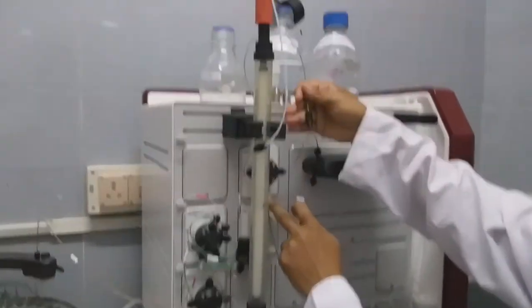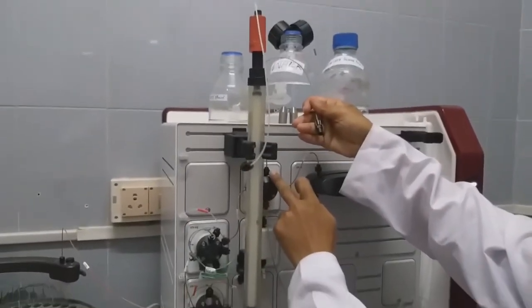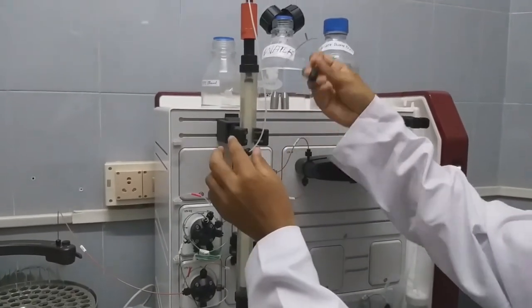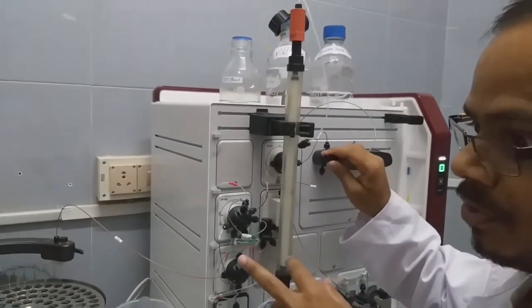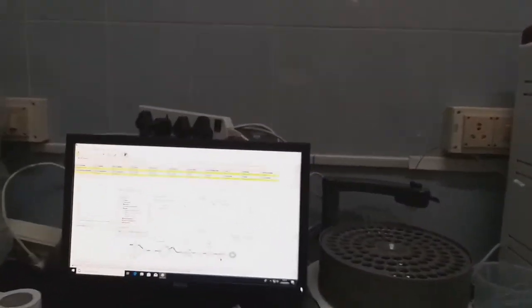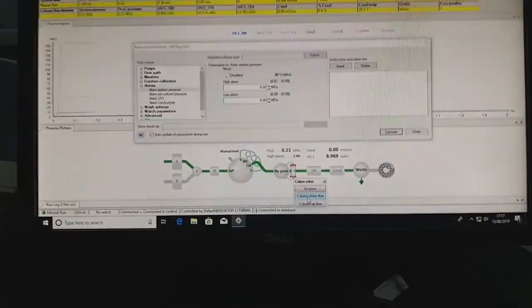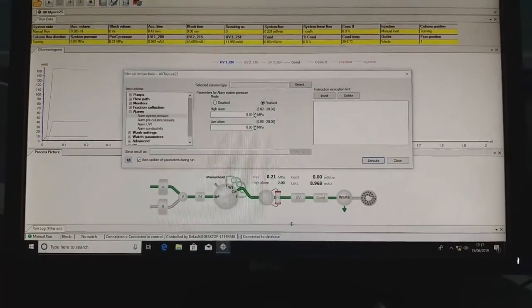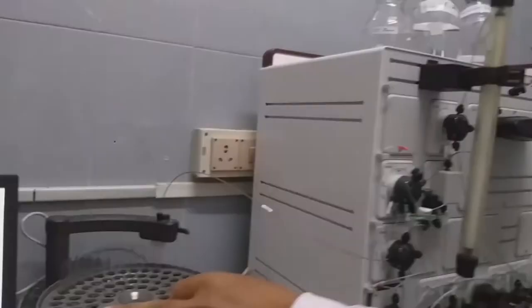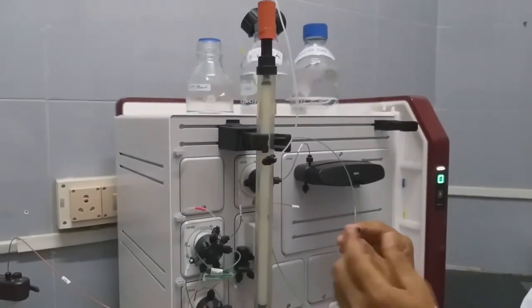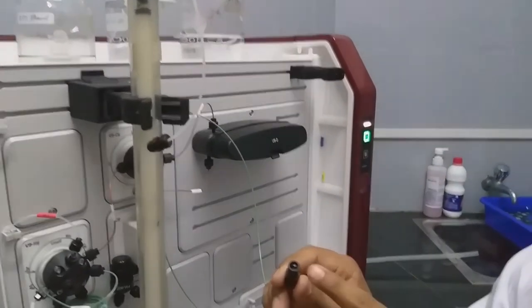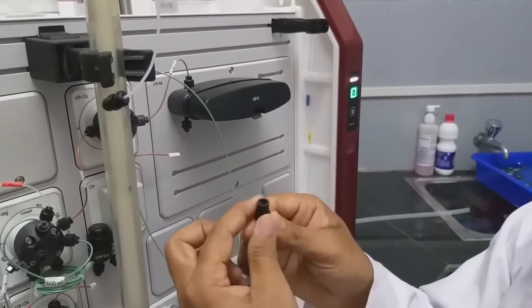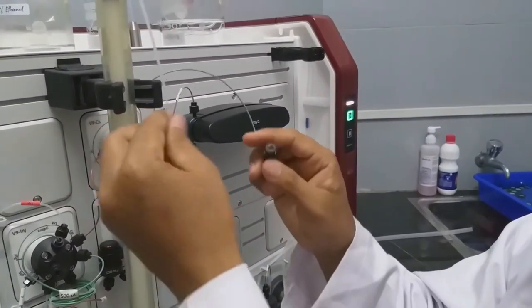Next, this is the column-connecting portion. This is the upward portion where we connect the column. Since we are not using the column bypass, we click Column Down — from top to bottom. You cannot directly connect the column. First, you have to fill the buffer or water into this loop so that there are no air bubbles.